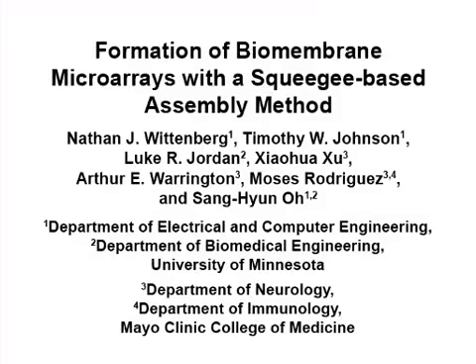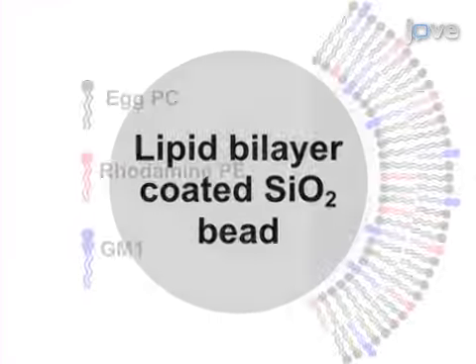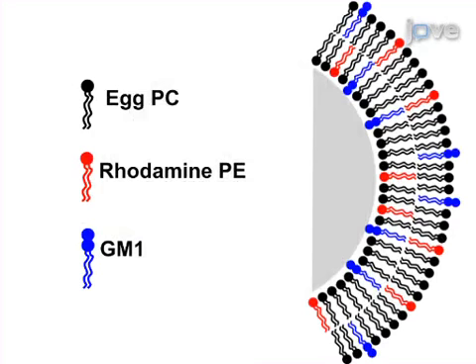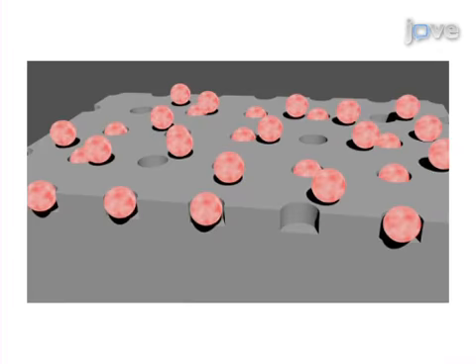The overall goal of this procedure is to create biomembrane microarrays using a simple preparation method. This is accomplished by first coating silica beads with lipid bilayer membranes. The second step of the procedure is to deposit the lipid-coated beads on a silicon microwell substrate.